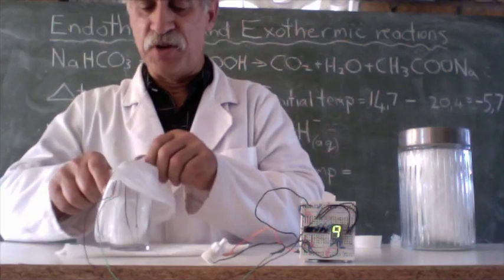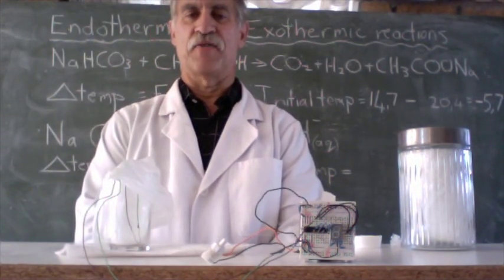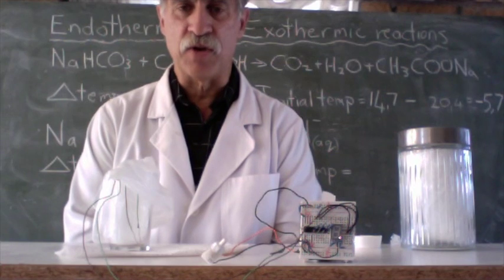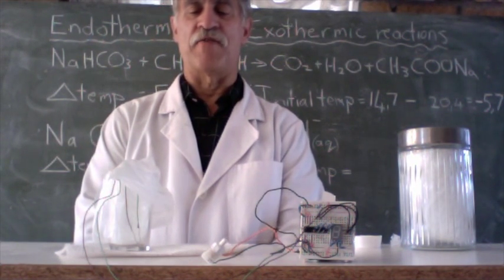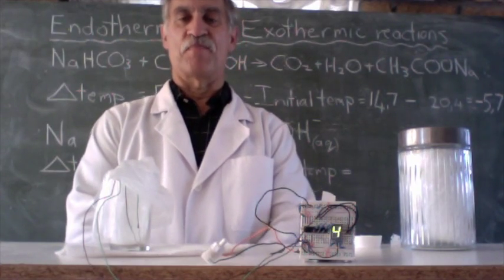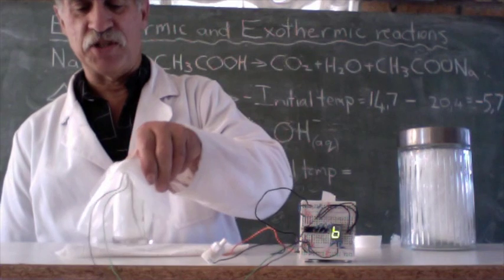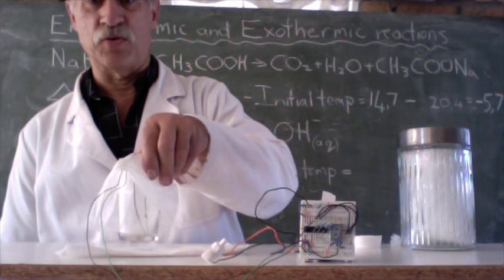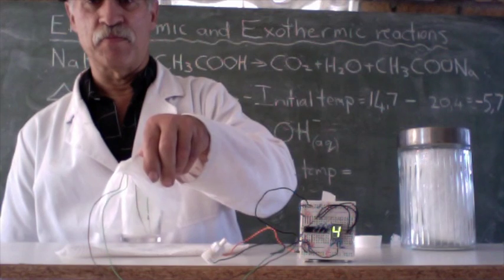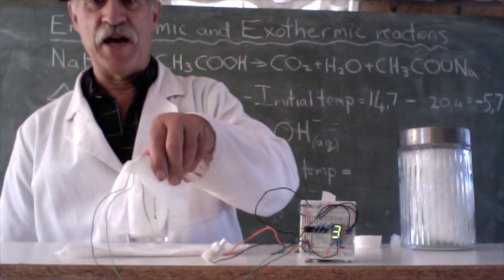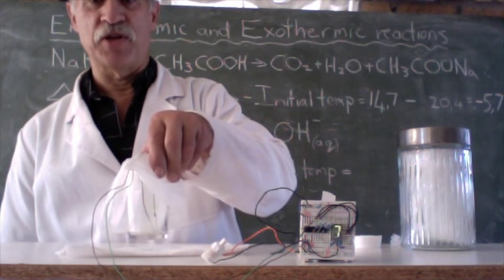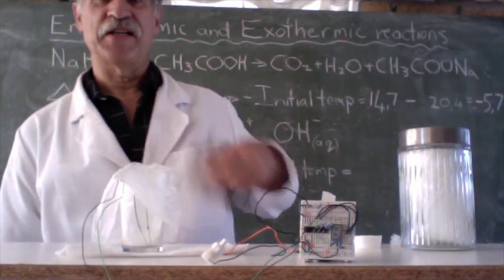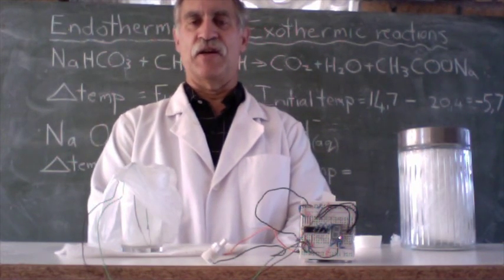If we were to stir this we would see that our temperature is going to get higher and higher as it dissolves. 42.0, 43.7, 44.5. So our temperature is going up all the time as the sodium hydroxide dissolves. And if I had to stir it a little bit, I'm sure our temperature would go up even more. 51.0, 48.1, 49.8, 49.3, 48.7. Okay, so let's make it 49 was the highest that it reached.